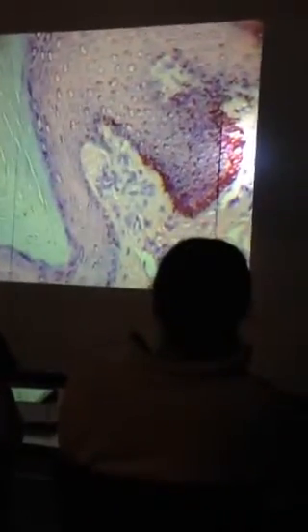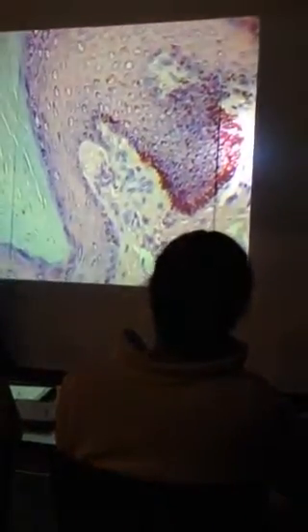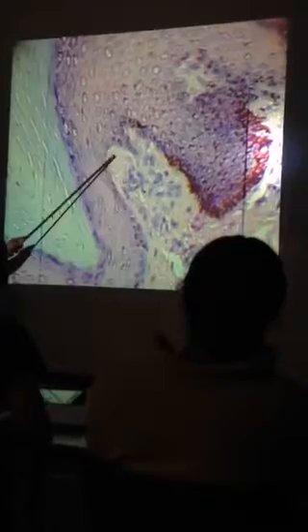What kind of tissue is this? Dense irregular connective tissue. You can put CT, but make sure if I ask you if it's a type of connective tissue, you put either connective tissue or CT in quotation marks, so you don't have to spell it out every time. And it's around a corpuscle? It's all of this. All the dermis is dense irregular connective tissue. Yeah, the corpuscle is right up here. See this thing right there? That's the corpuscle.